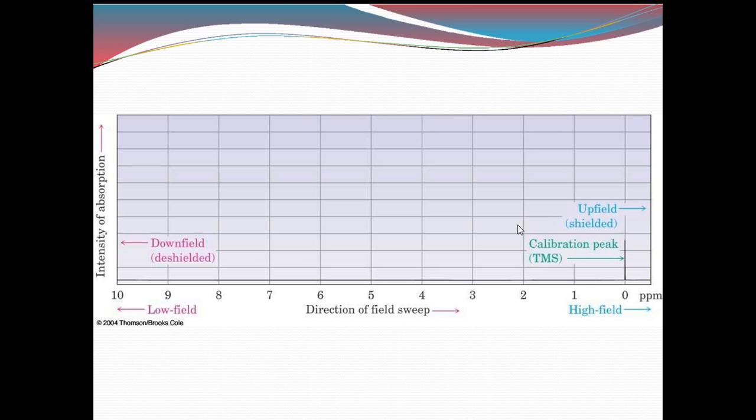So what will happen? You have to give a stronger magnetic field. If the molecule is more shielded, you have to give more strength of magnetic field. So high strength magnetic field is more required in the case of hydrogens which are surrounded with electron giving groups. In this case we can see that this is deshielded, that means the hydrogens are surrounded with electronegative groups, which themselves will take the electrons from the hydrogen.